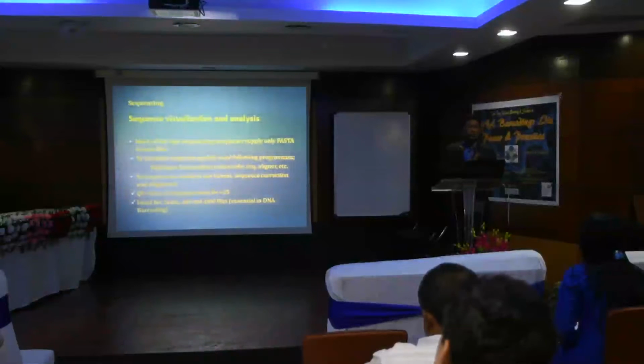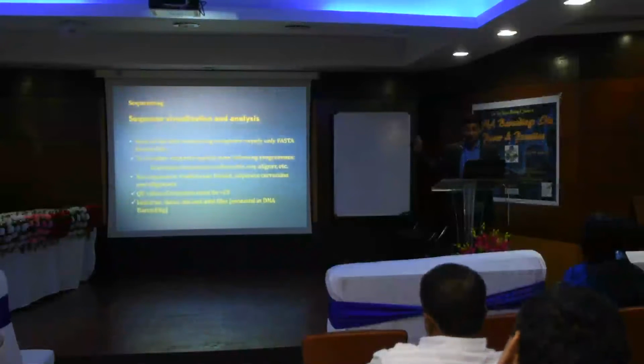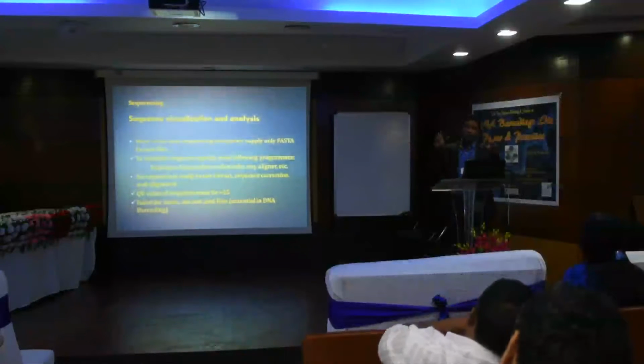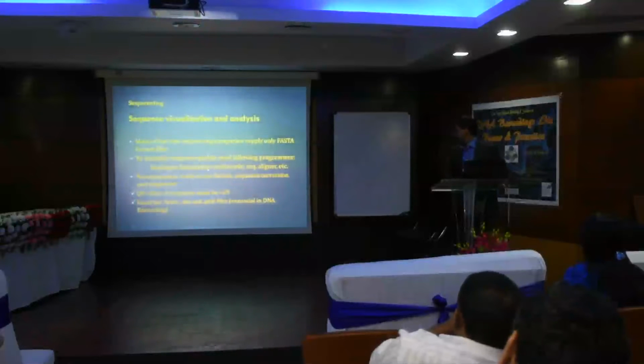Lot of students, you are getting a sequence of 100 base pairs, and he can extend it up to 250 base pairs using Sequencer, because it will recognize even poor base calls and give whatever you want. The student just needs to click and pull it, and then he will take this as a good sequence. So don't use that program.